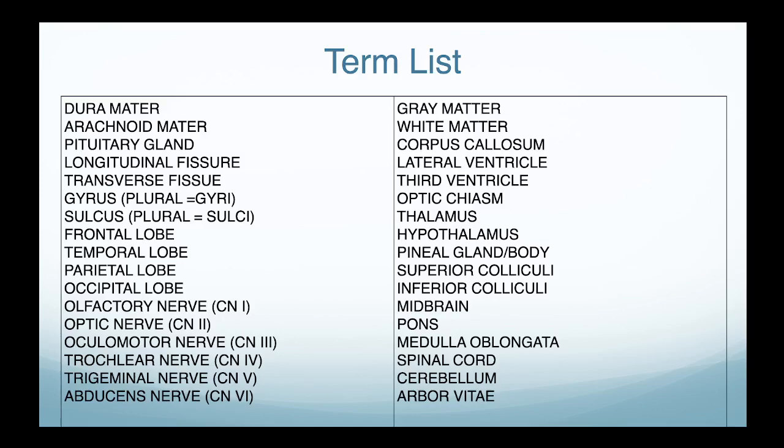We're not going to go over cranial nerves 7 through 12, mostly because for the sheep brain dissection, once we remove the dura mater, unfortunately, the dura mater takes along with it the majority of the remaining cranial nerves. And quite honestly, we're only going to really be seeing cranial nerves 1 as well as cranial nerves 2, just because those are some of the larger cranial nerves that you'll find in the brain overall. These are other terms that I expect you to know, so we're going to go over those throughout the course of this lecture, so you can review that at a later time.